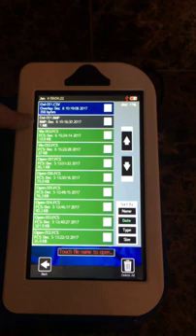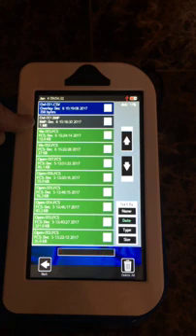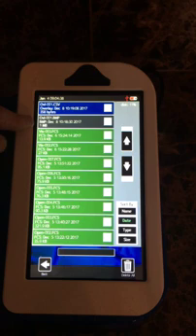We also enable bitmap screenshot saves, which are really nice because you can generate instant lab reports. If you're a CRO and you're wanting to incorporate these screenshots into your reports for customers, you simply save the bitmap and drag and drop it right into a PowerPoint or Word document.